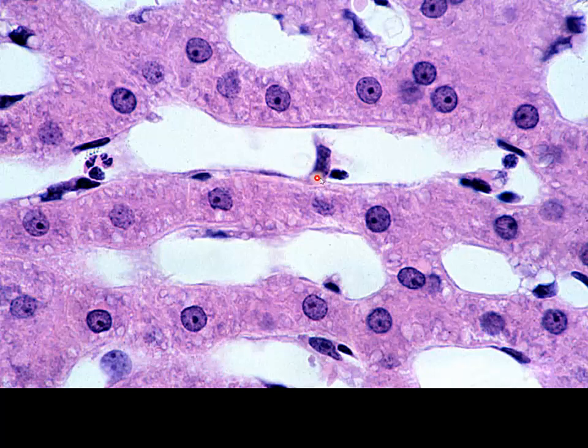Then we have these cells that are present in the sinusoids themselves. Now, some are going to be blood cells. We're going to see red blood cells present in these sinusoids, but these large cells that have the vesicles present in them, remember, these are going to be our resident macrophages, our Kupffer cells.